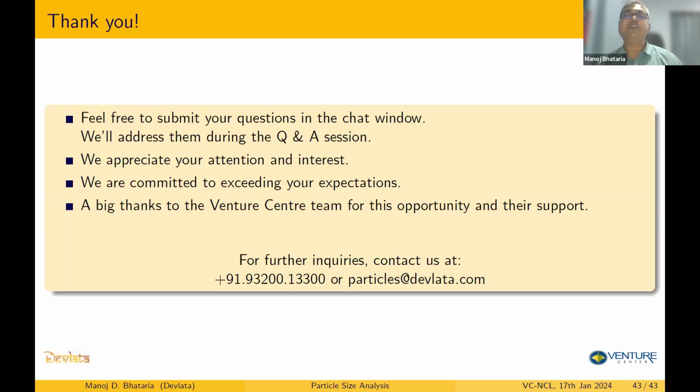Now you have to do this with some experimentation. You start with one particular concentration, you get some result. You try a higher concentration, you get some result. Then you do some intermediate, and then you can arrive at the optimum concentration for your sample. Now, if you do it for a different class of samples, probably you have to use the same methodology again, arrive at the right concentration, and then go for it.